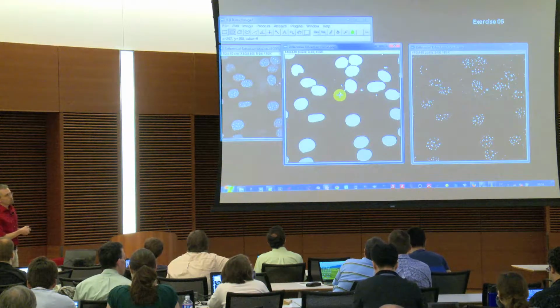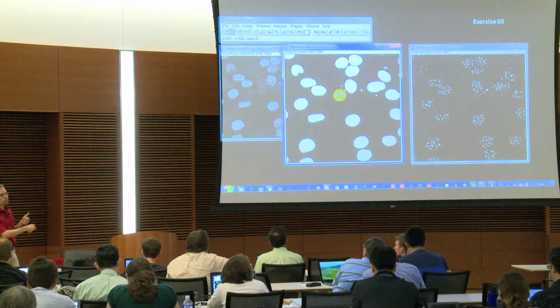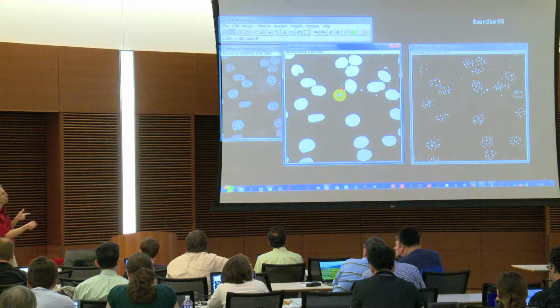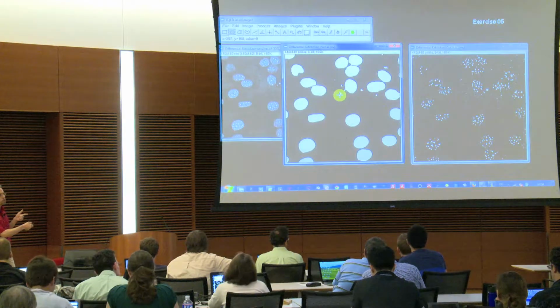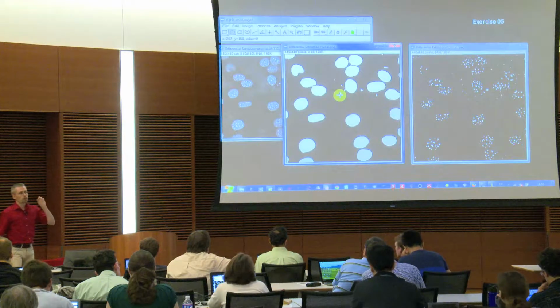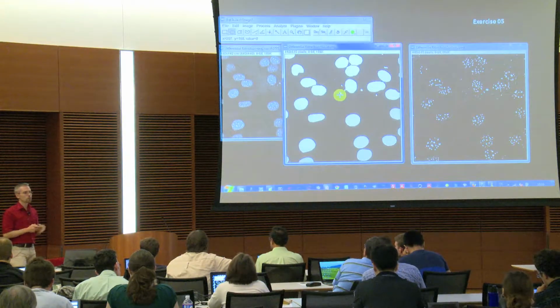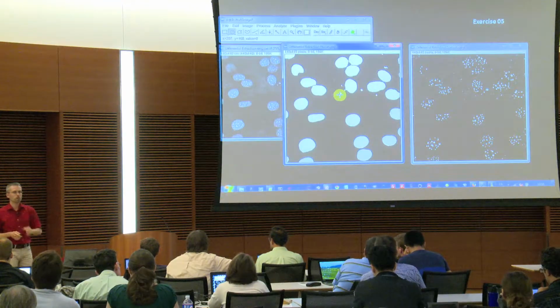First of all, what I still need to exclude here, in those kinds of analyses, is every object which touches the edge, because it's not complete, that would mess up my results. And all the small things, because they are obviously not objects of interest. So to this end, it might help to estimate what is approximately a size for an exclusion to eliminate the small ones and keep only the big ones.